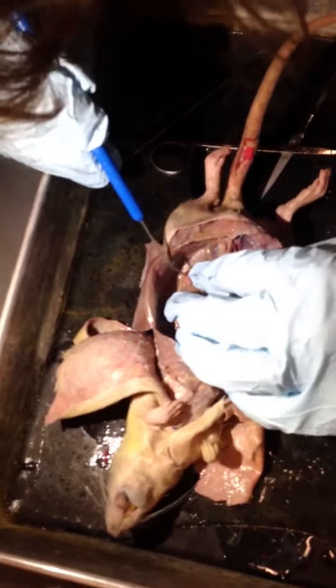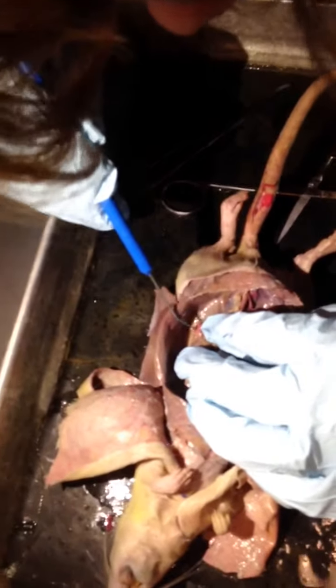Yeah, so there's your ovarian bursa, this little pink thing. And I think that's it.